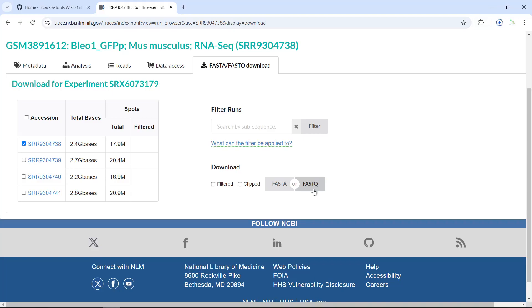As mentioned, you can only use the direct link to download data smaller than 5G. If the data is bigger than 5G, you have to use the SRA toolkit. So we can go back to do the demonstration.